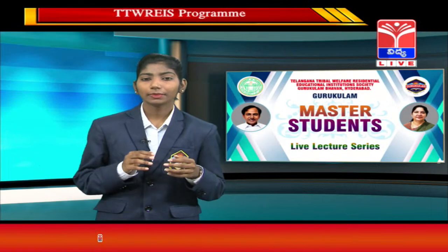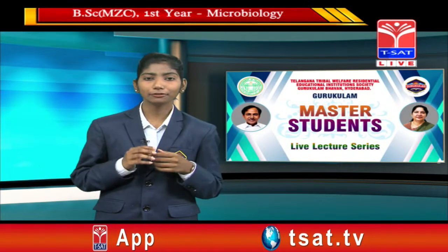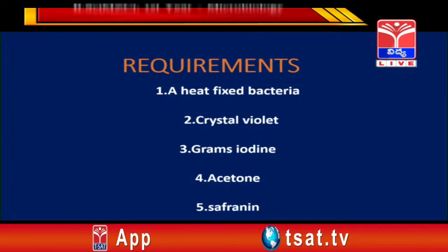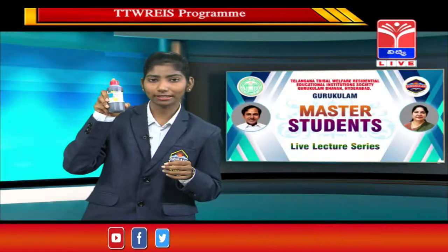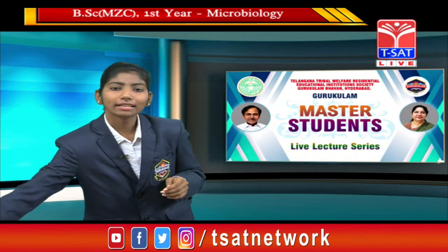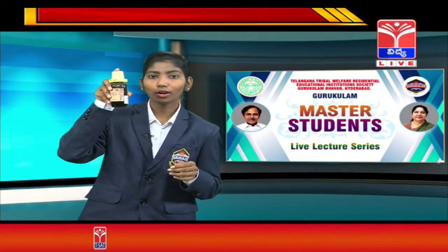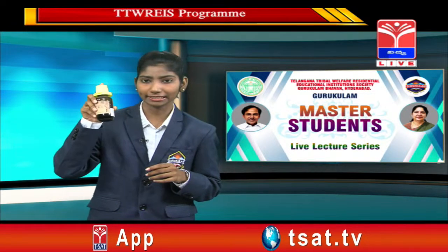And next, the requirements used in this Gram staining are heat fixed bacteria, and the next one is crystal violet. Yes friends, it is crystal violet. And the second one is Gram's iodine, which is used in the Gram staining technique.